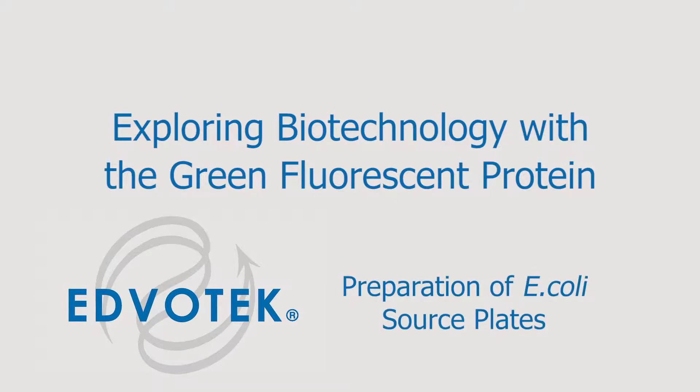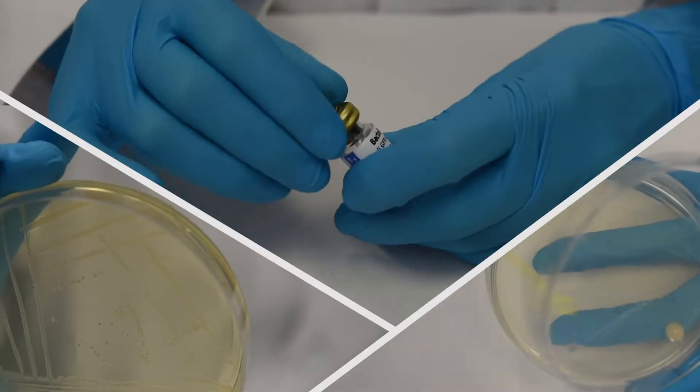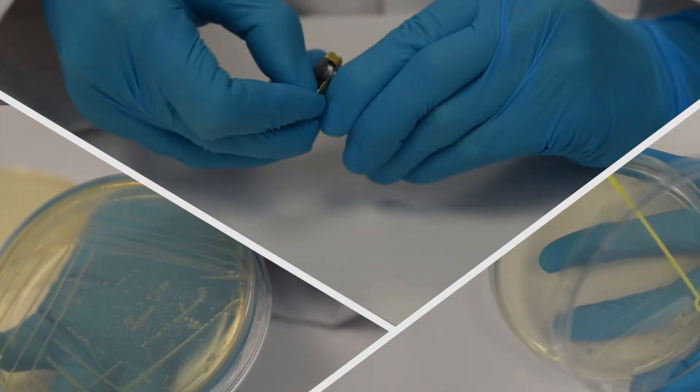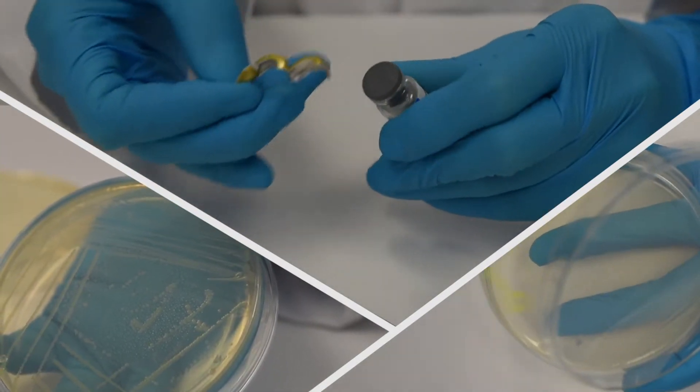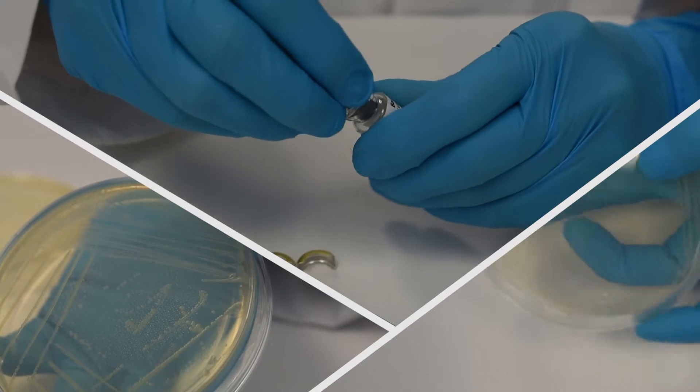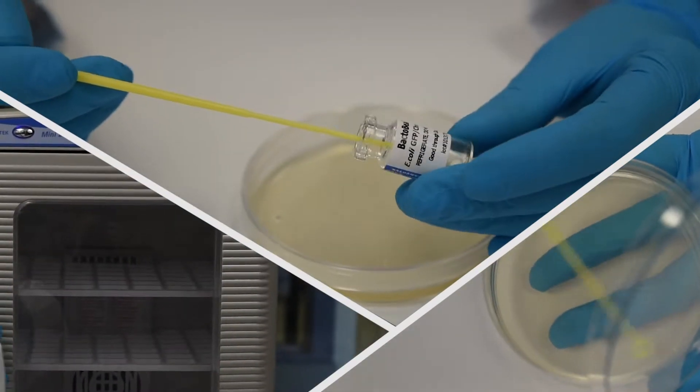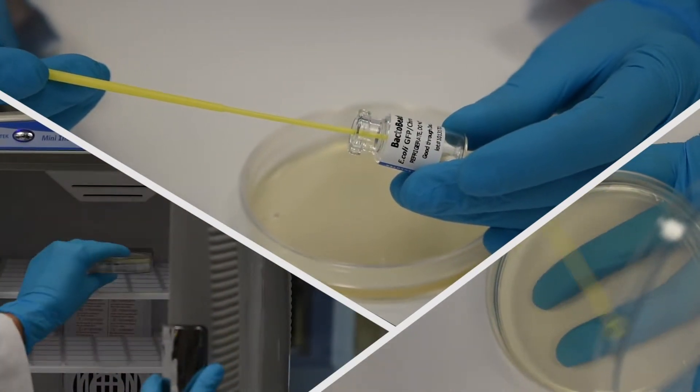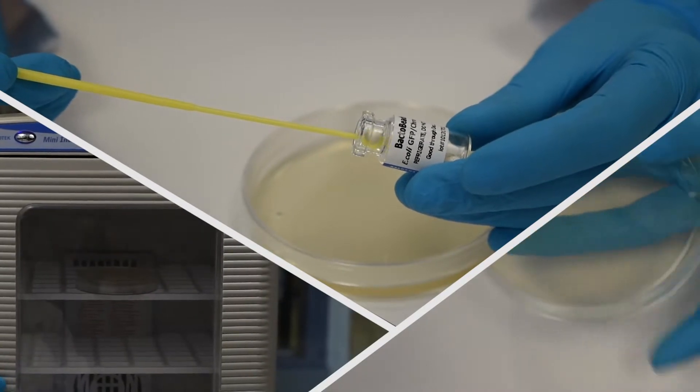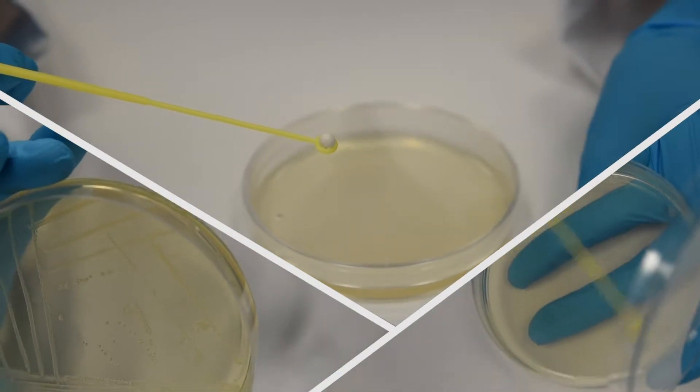Preparation of E. coli Source Plates. For best results, the E. coli source plates should be streaked 18 to 22 hours before the experiment is performed. Preparing the source plates more than 24 hours before the activity may compromise the success of the transformation experiment.